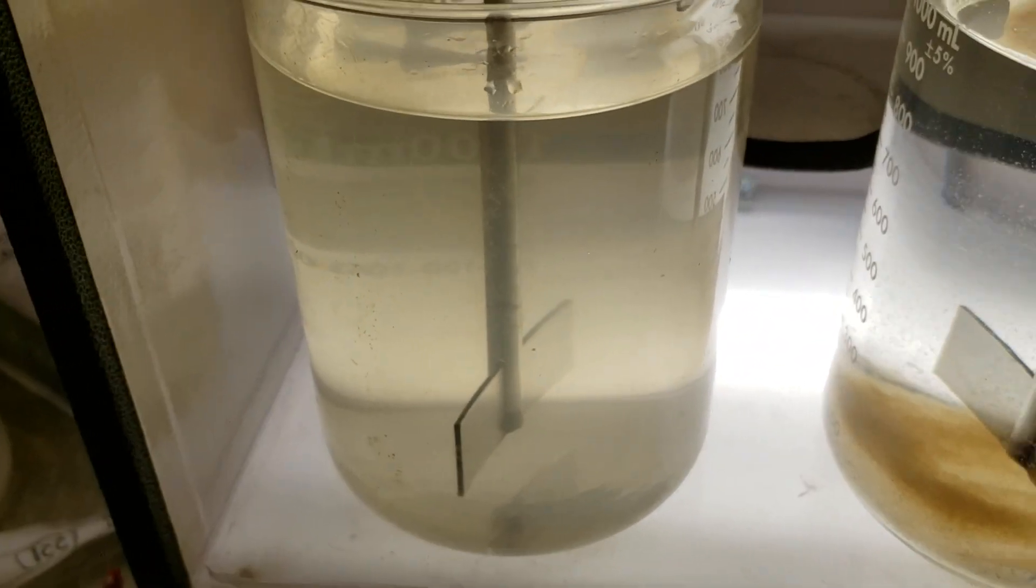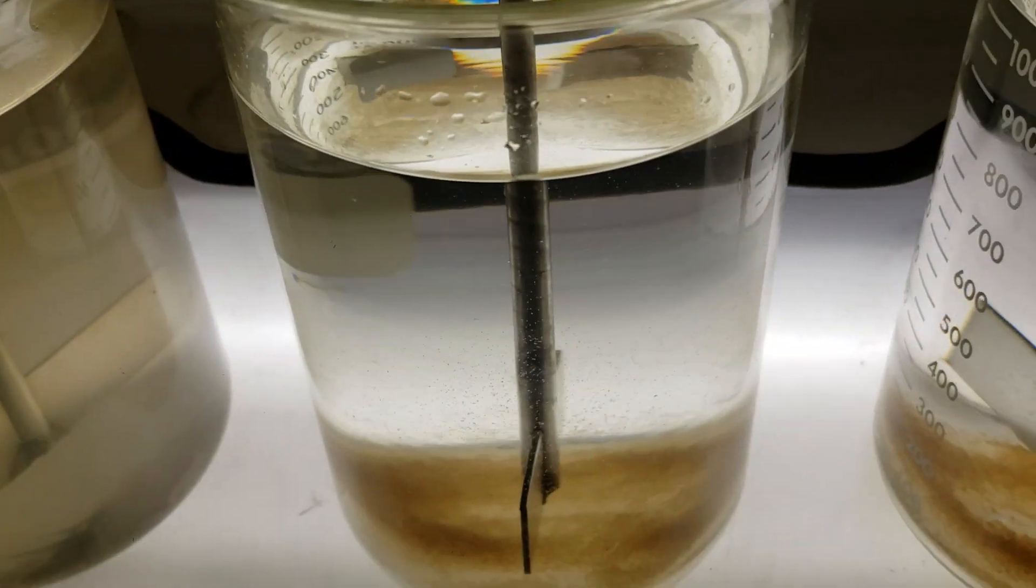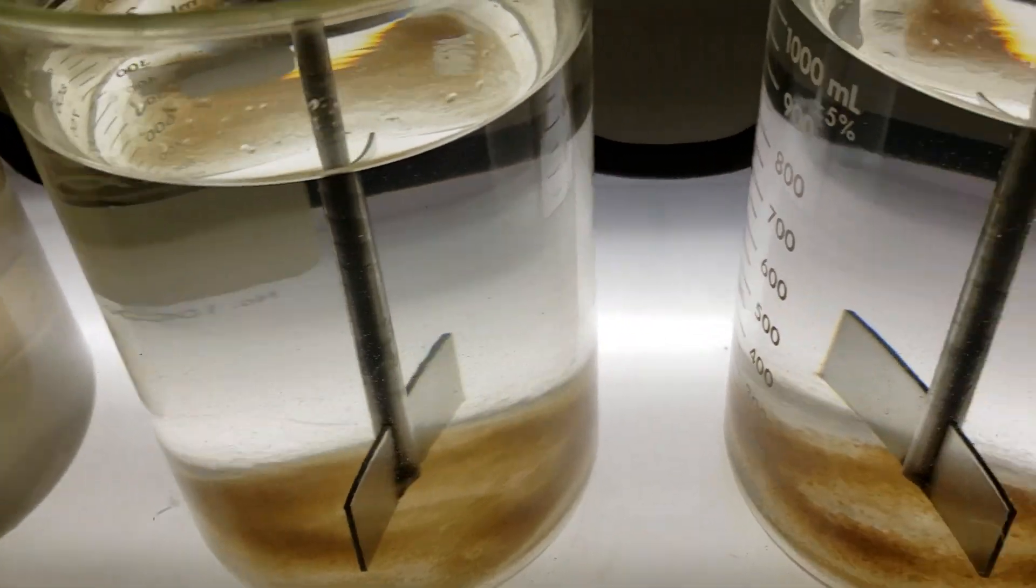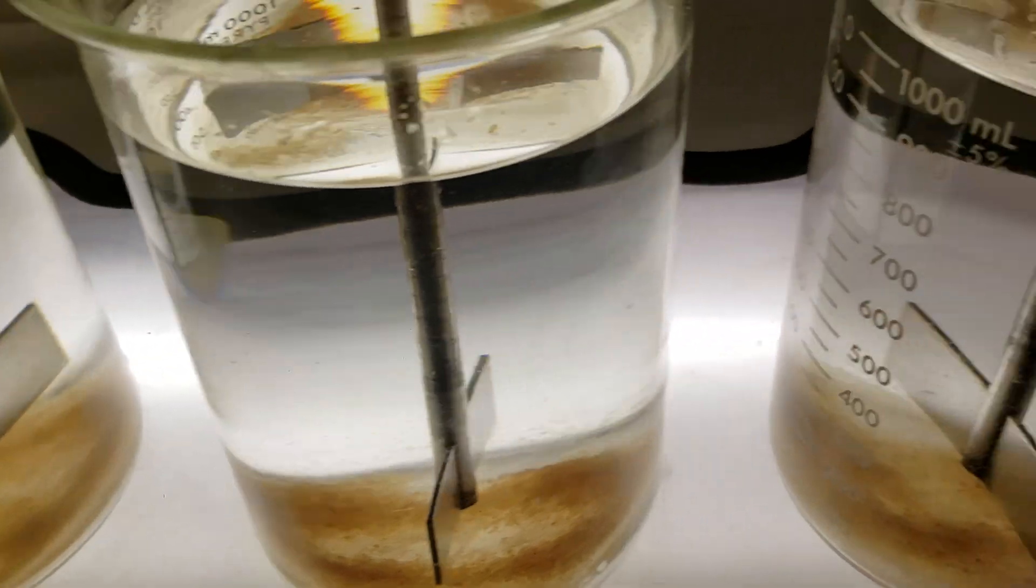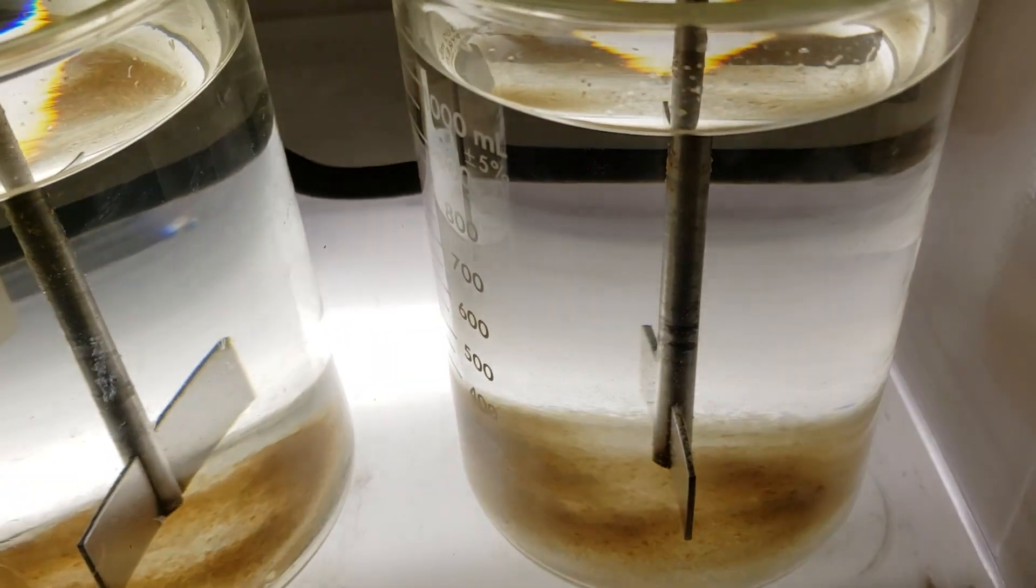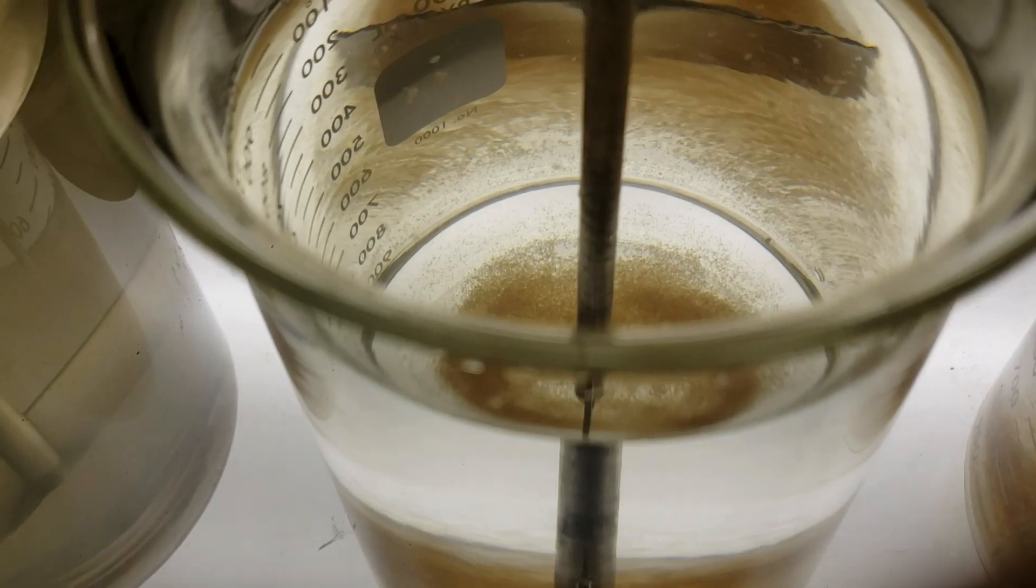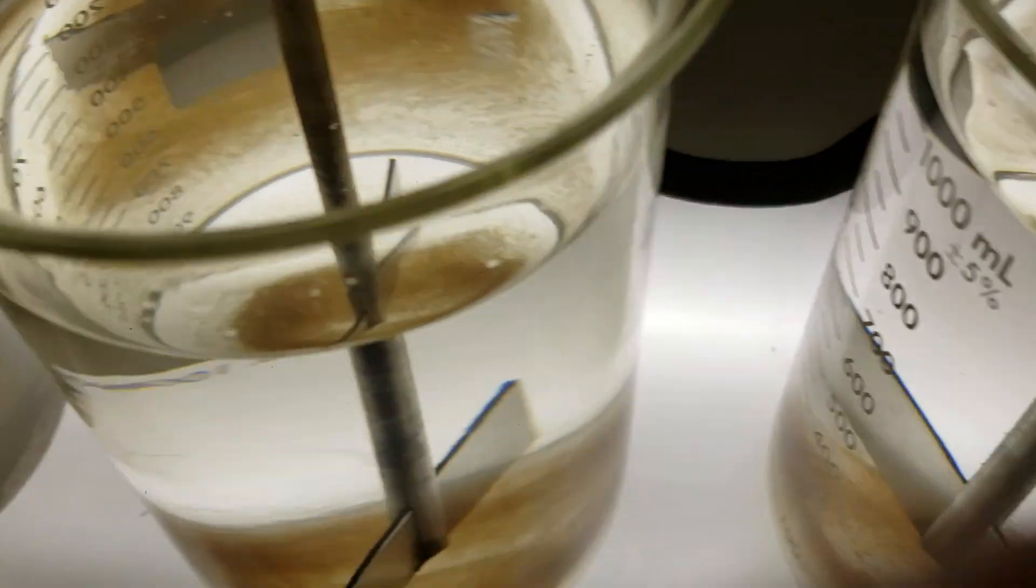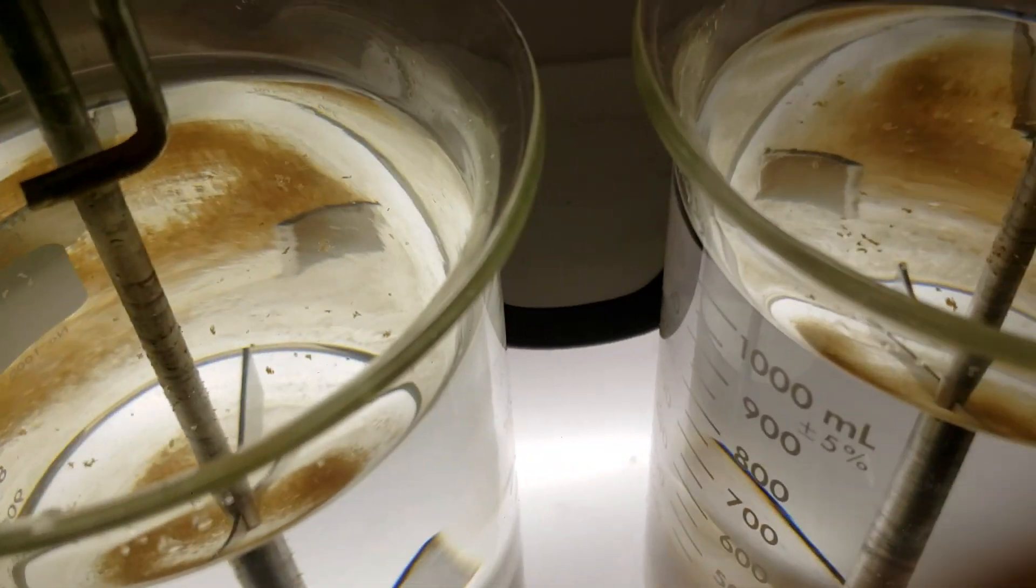All right, so that's untreated raw water, 5 ppm, 10, and 15 of the coagulant. We've got a few little surface floaties, maybe a few more floaties on the 10 and 15.